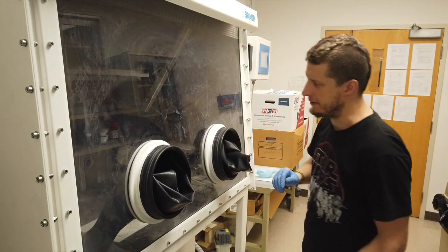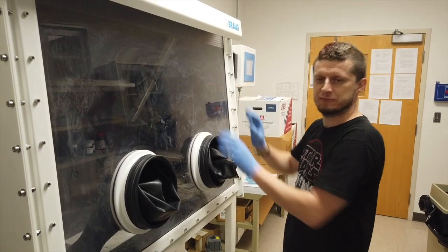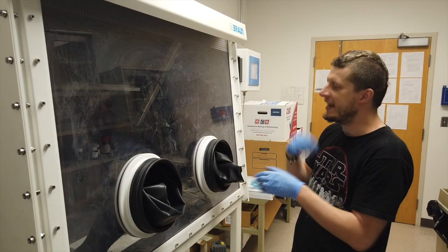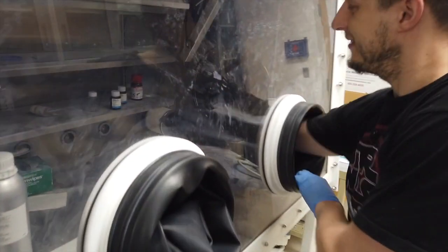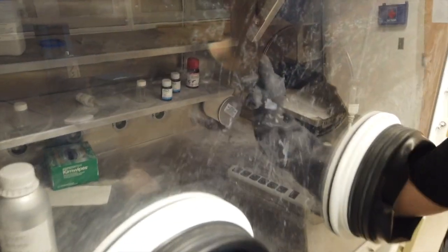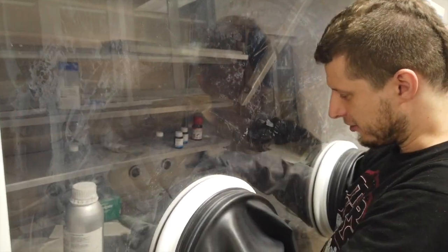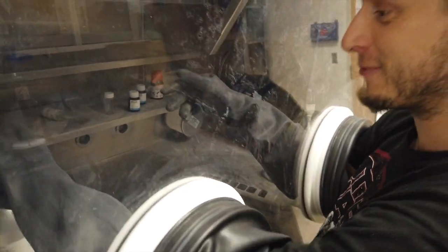This is named a glove box, and in the glove box there is an argon atmosphere, because argon is a totally different gas which is inactive. Inside I have a material, some polymer, and this polymer doesn't like air so much. It would be hard and agglomerated. So what I'm doing here is using this different atmosphere. It's like having a different planet in your office or in your laboratory.